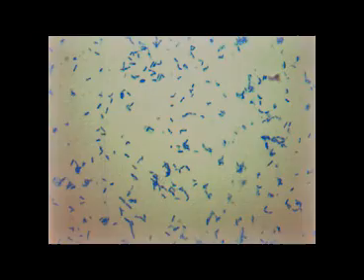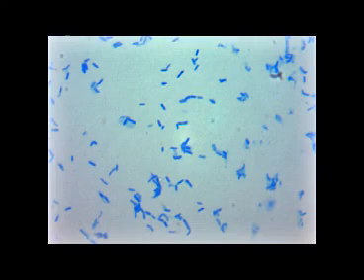Simple stains are observed with the microscope using the oil immersion lens. This has a total magnification of 1000x. As seen here, all of the bacterial cells are the same color. This slide was made with the basic stain methylene blue. Notice, the only thing you can determine from this slide is the size of the bacterial cells, the arrangement, and of course the morphology or shape.